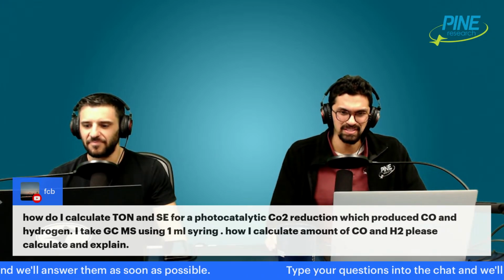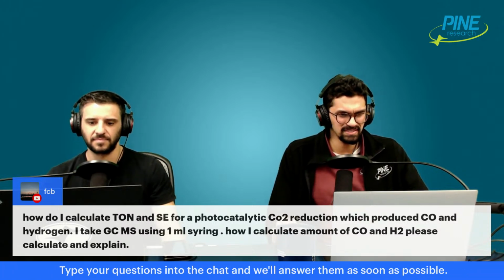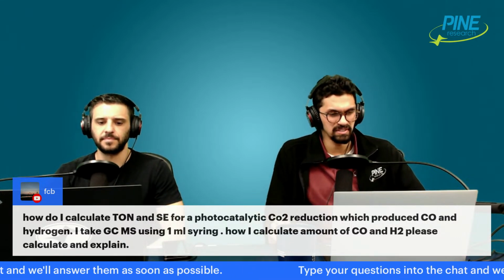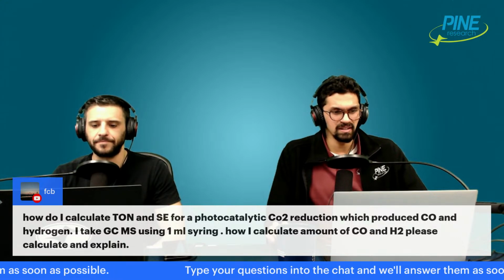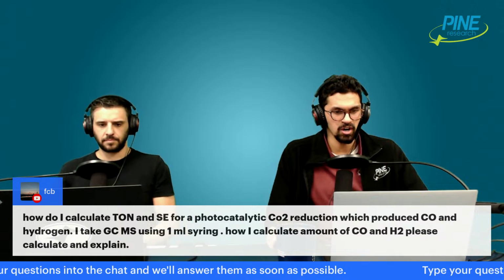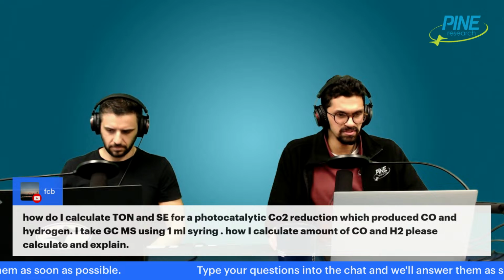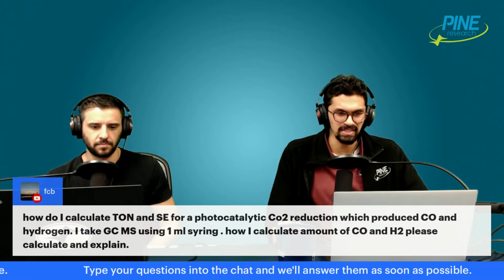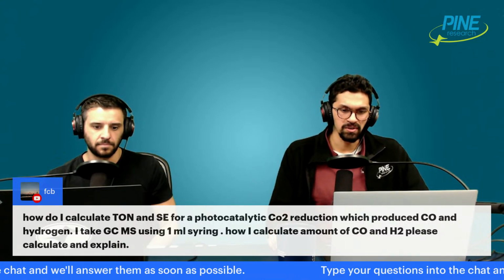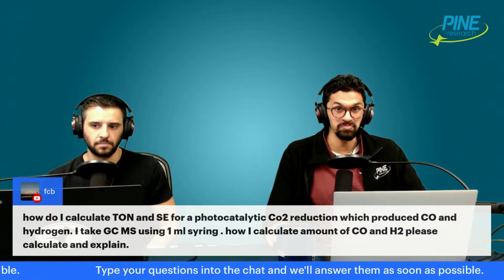FCB has a question about how to calculate the turnover number, and I think it's some kind of efficiency. What's the S efficiency? I don't know. I think you may be referring to something like a Faradaic efficiency. But you're doing a photocatalytic reduction of CO2 to produce carbon monoxide and hydrogen. You do GCMS using a 1 milliliter syringe, and you're just trying to calculate how much CO and hydrogen you're generating. So part of the answer to this is actually just in mass spec.